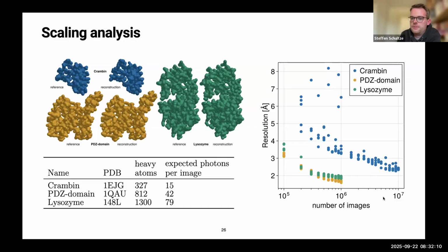If we look at how many images are required to reach a given resolution, for the smallest one it's by far the highest. That is just because the images there contain fewer photons. And if there's background noise and all that stuff, then this effect is much more clear. In the end, that's really the reason why this has so far experimentally been applied to viruses, right? Much larger stuff where you get millions of photons per image.